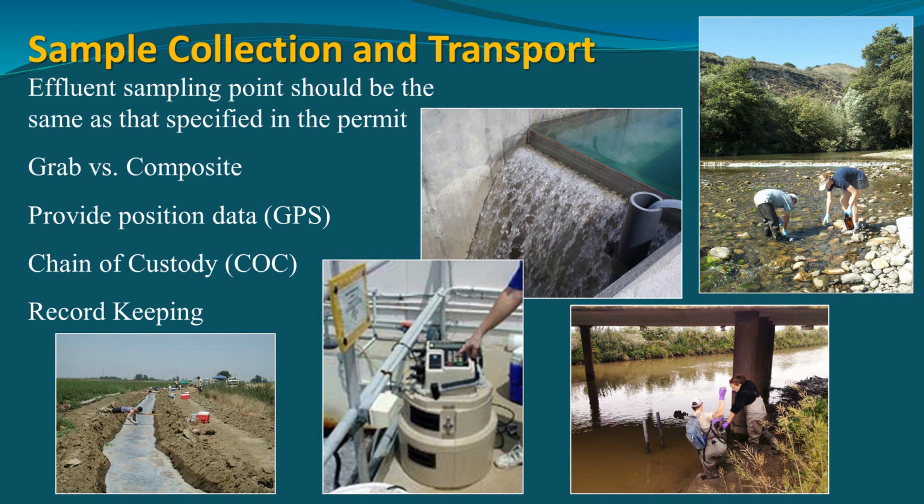And then a situation like this is more like a research situation. This is a spiked irrigation experiment that was done a few years back. And this is a precarious sampling pose right here, collecting a sample from some spiked irrigation water running through a ditch.